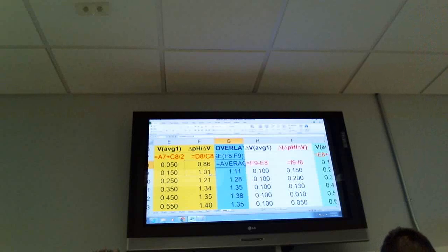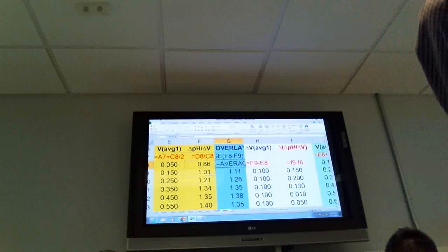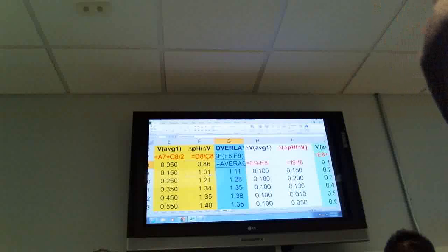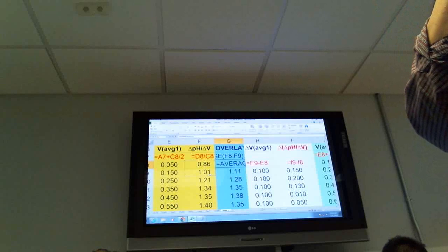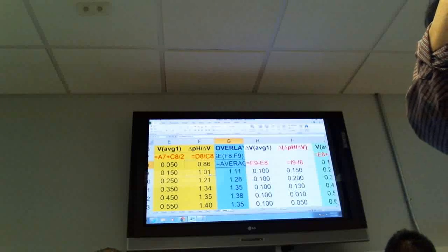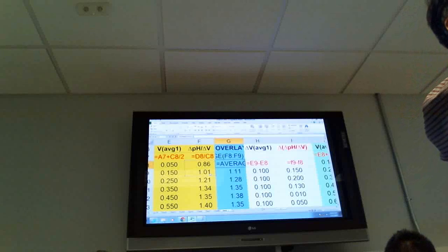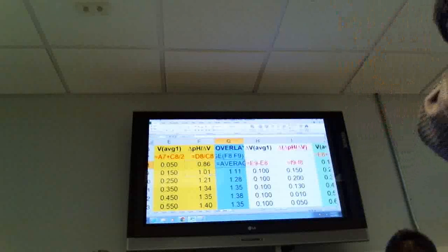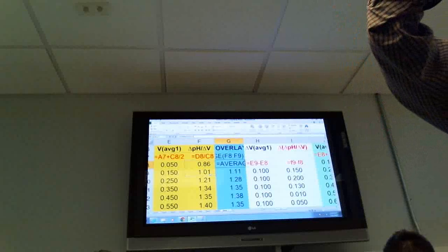What that means is I know what the slope is here and I know what the slope is here, but I want to know what the slope is here. And so all I did was take the average of the two slopes and said that would be the slope in the middle. That offsets the first derivative so that the data points now match. And so now for this volume, which is a volume I actually have, I now know the pH and the slope.